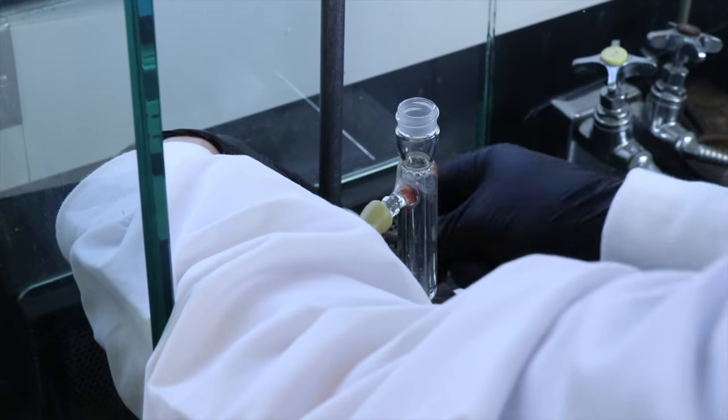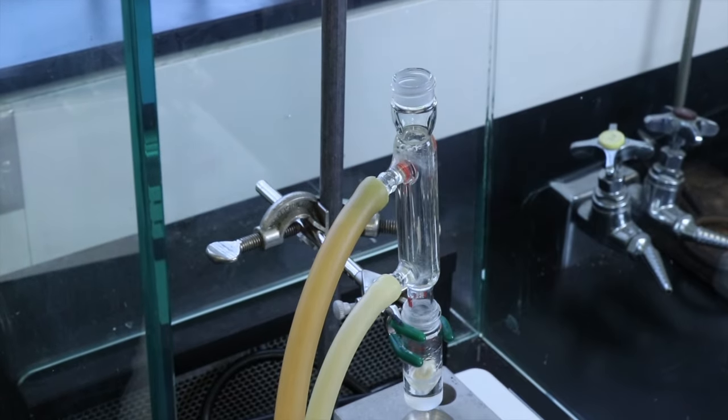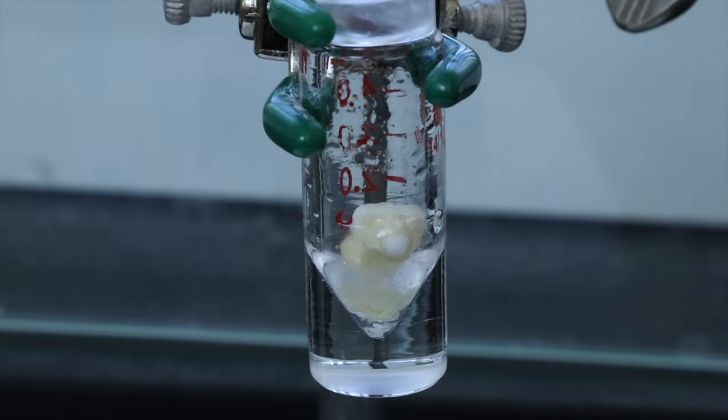Once the hour has passed, I'll lift everything off of the heat so the conical vial can cool. And here you can see the alcohol product gathering on the spin vane, and the acid product is going to be dissolved in the aqueous solution.